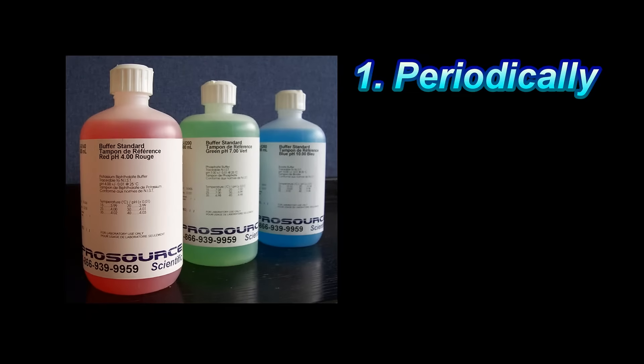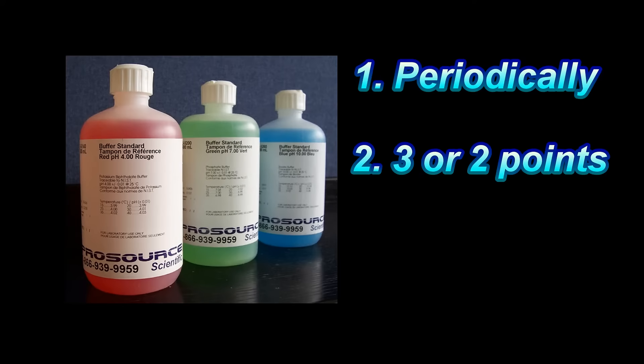It is suggested to calibrate PH pen regularly or you may calibrate it every time before testing to get best accuracy. Two points calibration is a must and you could increase to three points if your testing range covers from acid to alkali.